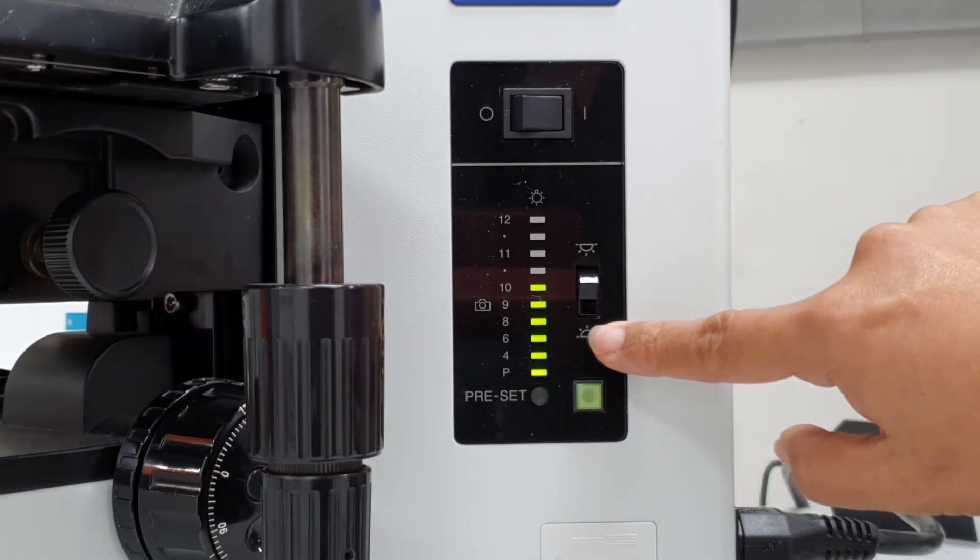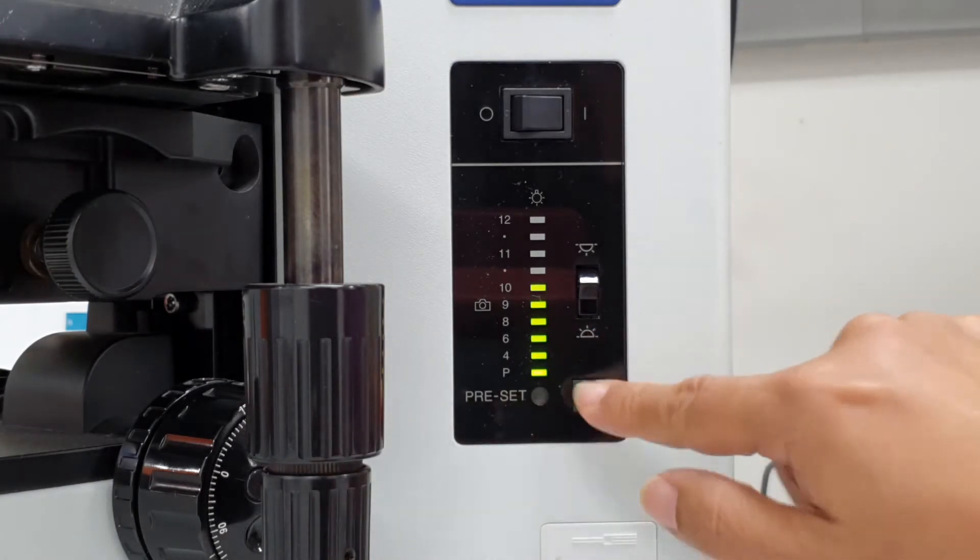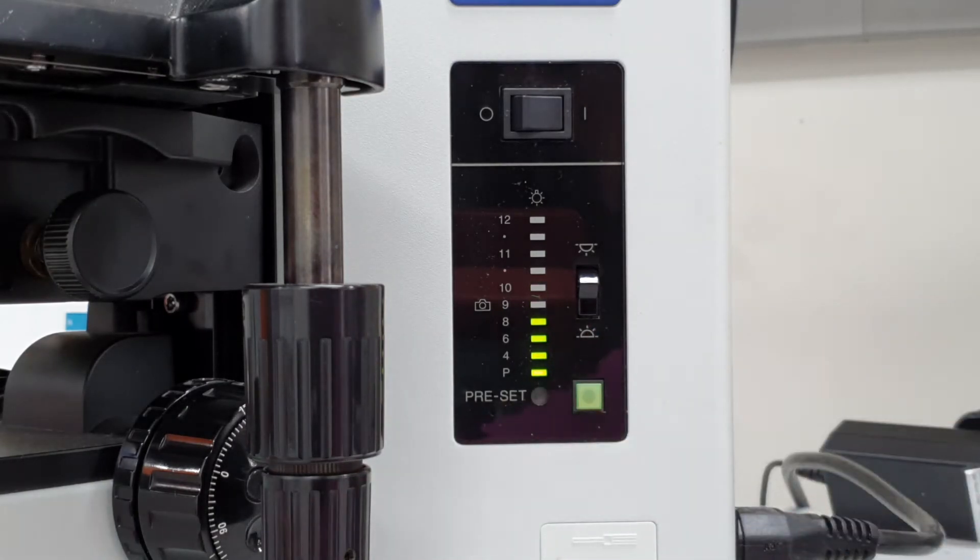First check the bottom lamp is on and the preset is off so that you can adjust the light intensity and that the bright level is suitable.